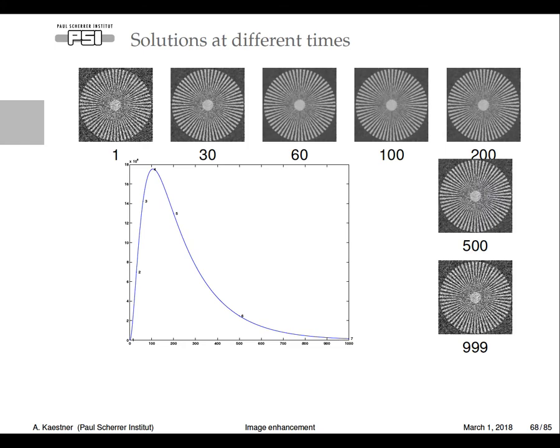And iterations actually have an interesting path. So in the beginning, you start filtering and you improve and improve. Also, you denoise more and more. And at some certain point, you're actually going back to the original. So when you tune this filter, you should usually work in the region around here. That gives you the best filter effect.